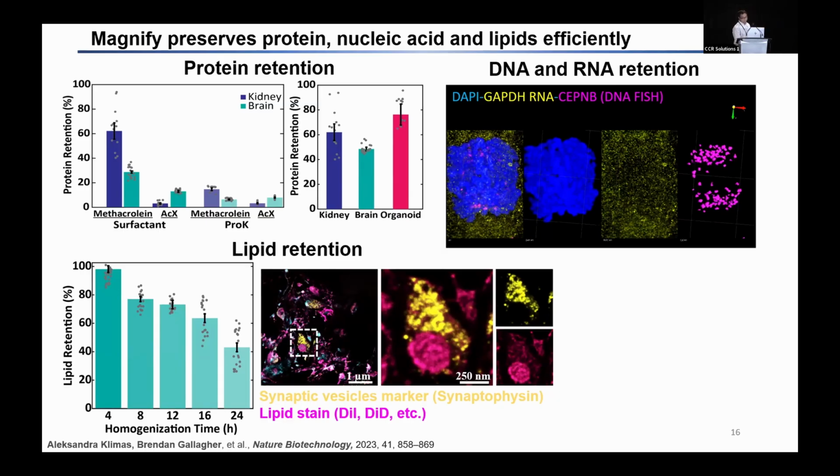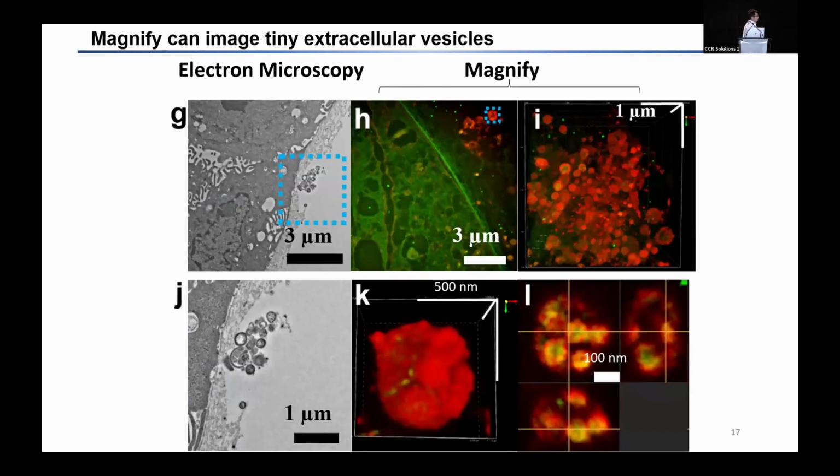So you can use this, for example, in expanded human-derived organoids. This is a lung organoid, so you have some mucus-secreting cells with the EVs, and then you can image the 3D clusters of the EVs secreted by those cells. You can take one of them, and with the confocal, you can do the optical sectioning and reveal the complex structure inside the EV.